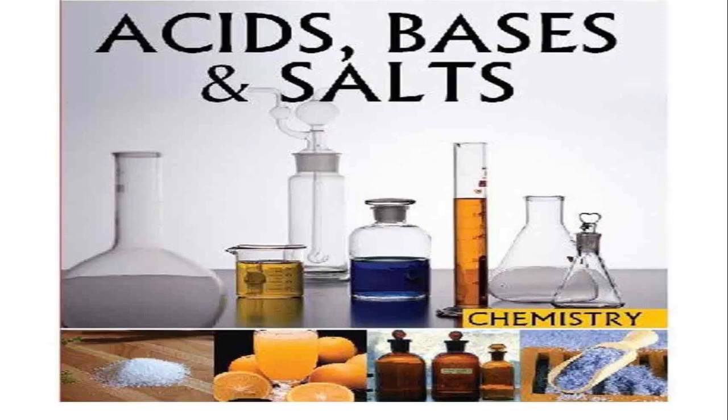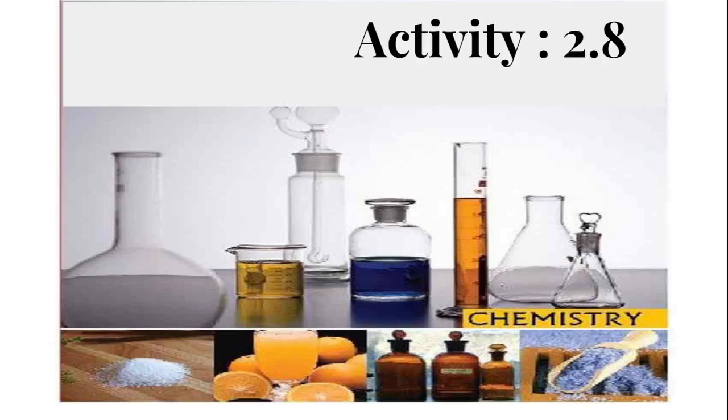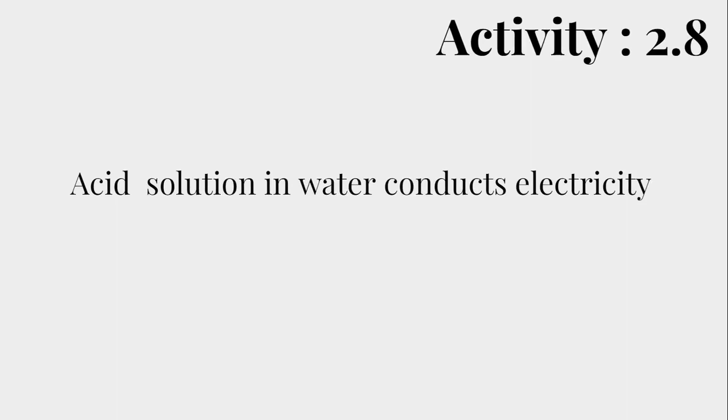Let us perform an activity to investigate whether all compounds containing hydrogen are acidic. So, we'll perform activity 2.8 in this video to check whether all compounds containing hydrogen are acidic or not. So, let us begin activity 2.8. The name of this activity is Acid Solution in Water Conducts Electricity.